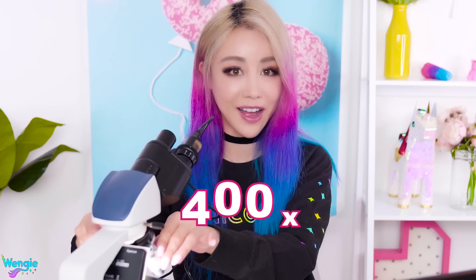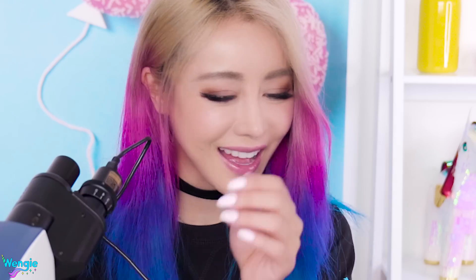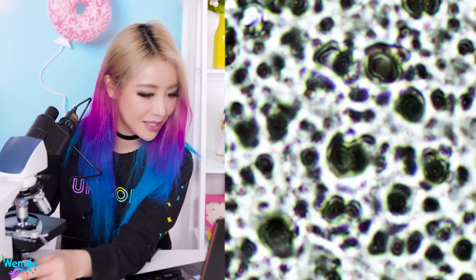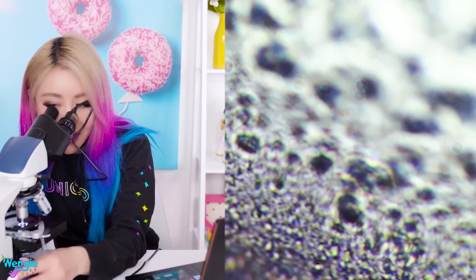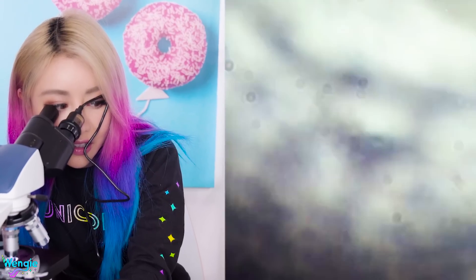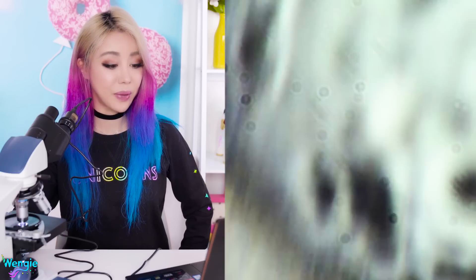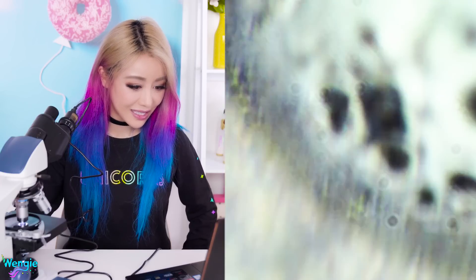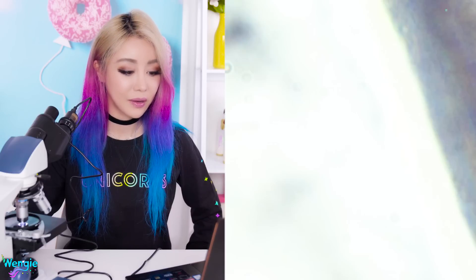Let's move on to the next zoom level — 400x. That's the slime. It looks like bacteria! Am I having a slime party? I'm going to move it towards the middle part of the slime — there's a monster appearing in the middle. That's the texture of the bubble. Look at this — these are the edges of the bubbles. This one looks dry and crusty. It's super weird how it's such a pretty purple on the slide, but once we magnify it this much, it is like black and white.